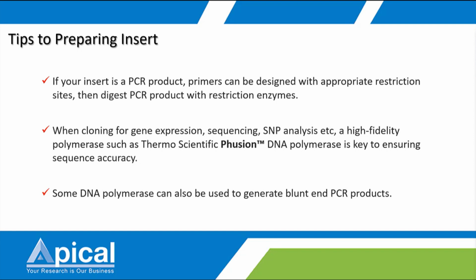Also, some DNA polymerases will generate blunt ends, which is suitable for blunt end cloning. So when you choose your DNA polymerase, you also need to double check whether this polymerase will generate a blunt end or a poly A tail, something like that.